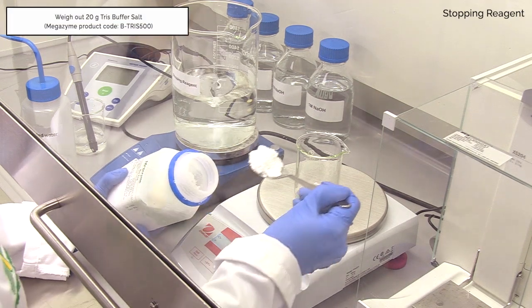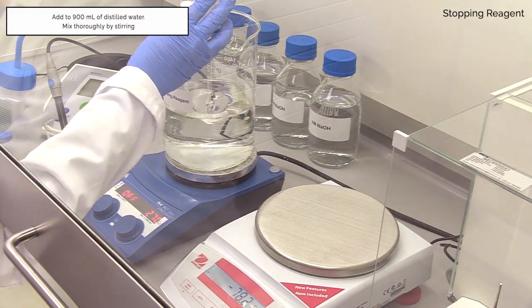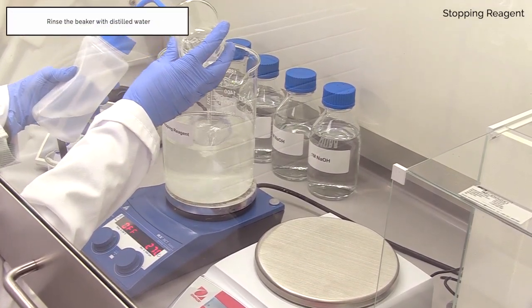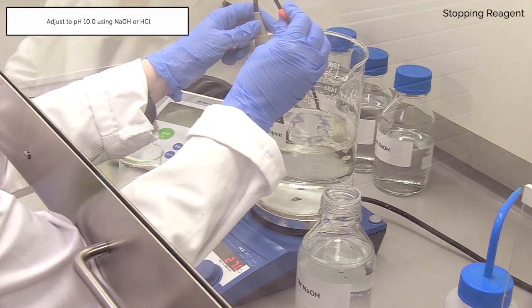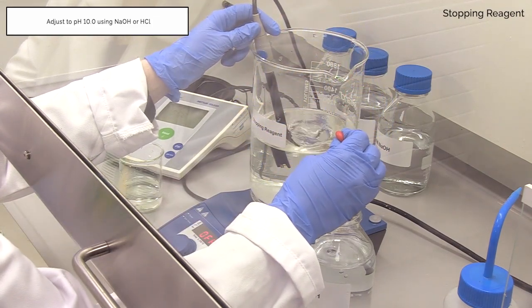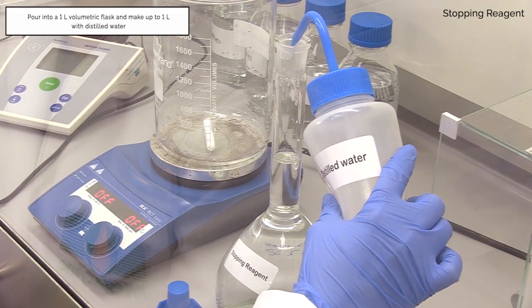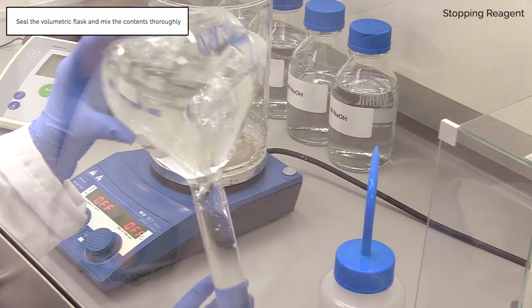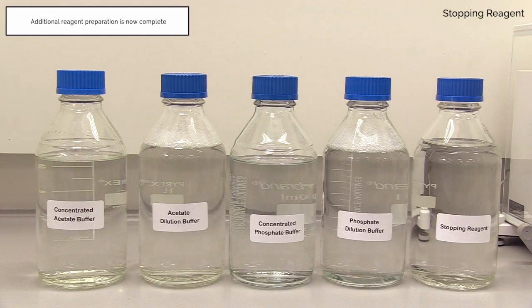Weigh out 20 g of Tris buffer salt (B-TRIS500) and add to 900 ml of distilled water in a stirring beaker. Check the pH and adjust if required using 1 M NaOH or 1 M HCl to pH 10.0. Pour into a 1 litre volumetric flask and make up to 1 litre with distilled water. Decant into a 1 litre Duran bottle. This is the stopping reagent. Additional reagent preparation is now complete.